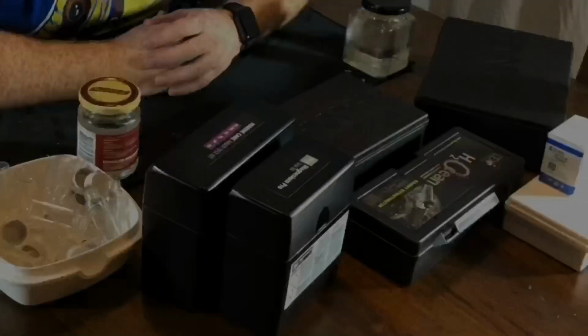We fully use the Red Sea test kits, as well as the Hanna Checkers. I love these Hanna Checkers, they just make life so much easier. But for those things that we don't have Hanna Checkers for, we rely on the Red Sea test kits.